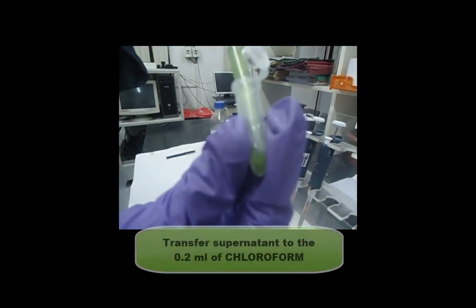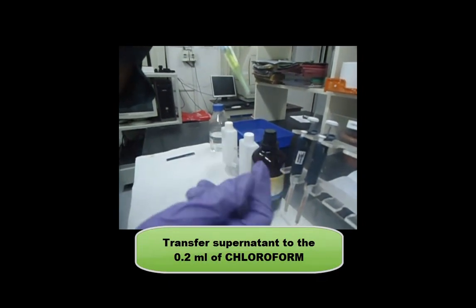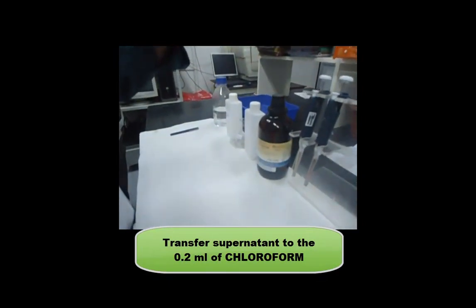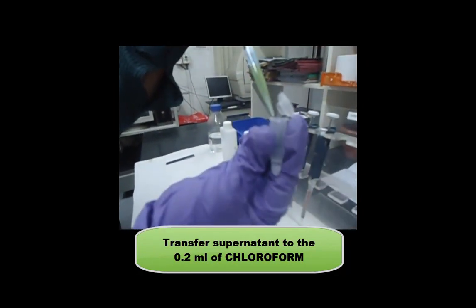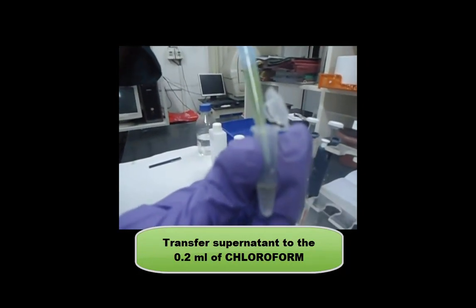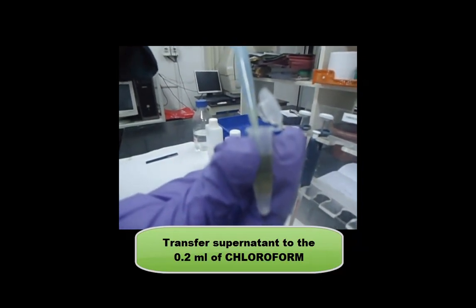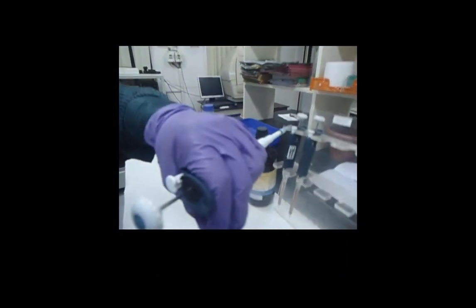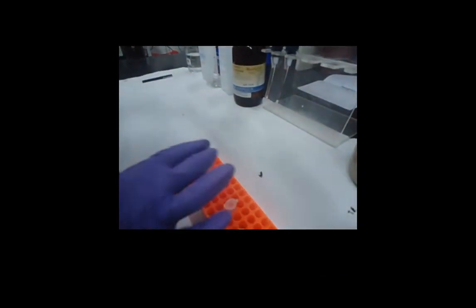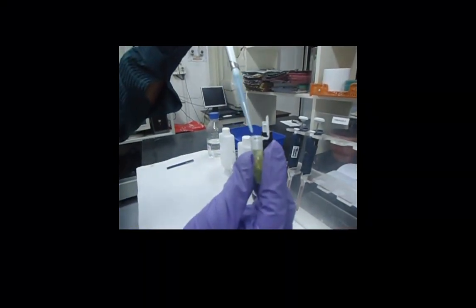After centrifugation, transfer the supernatant into another Eppendorf tube containing 0.2 ml of chloroform. Similarly, follow the procedure to transfer the supernatant of the stressed Arabidopsis sample to the chloroform Eppendorf tube.